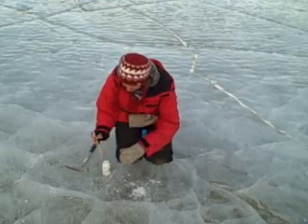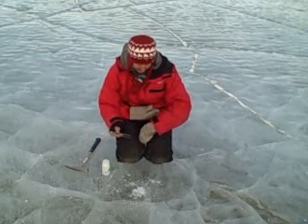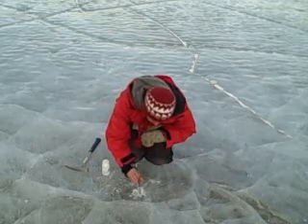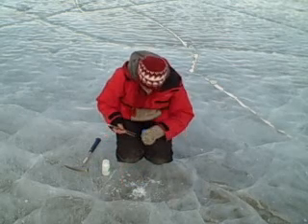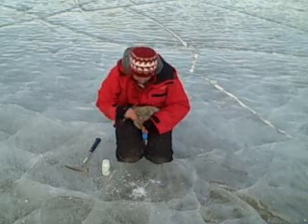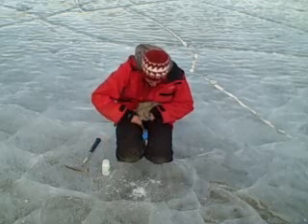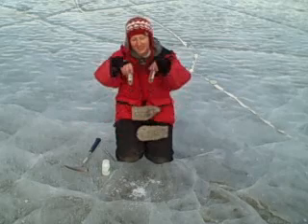Sterilize. And then now the trick is to catch these guys and get them into these tubes. There's one. There's two. So now we have our ice from Lake Bonney in our tubes and ready to go.